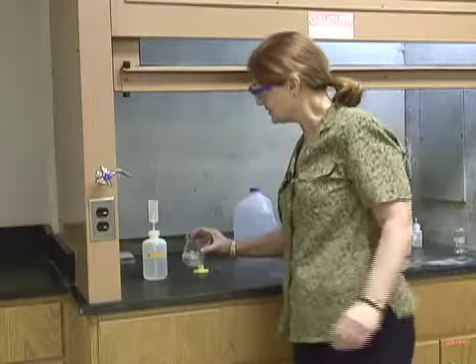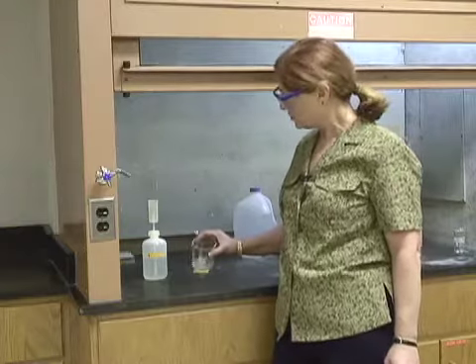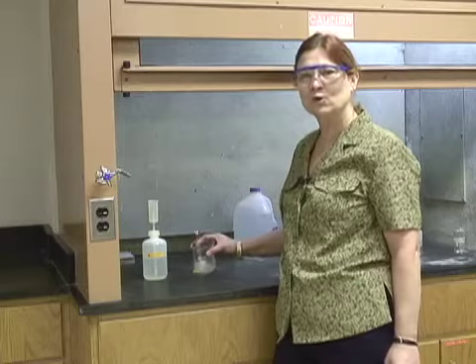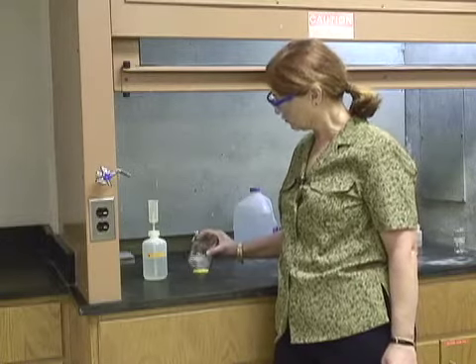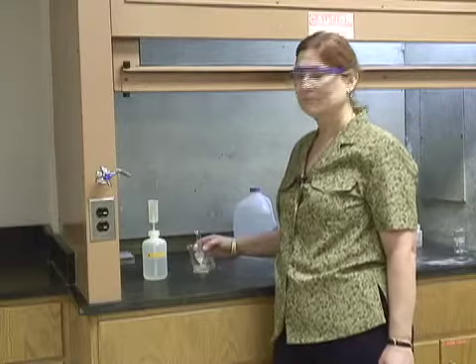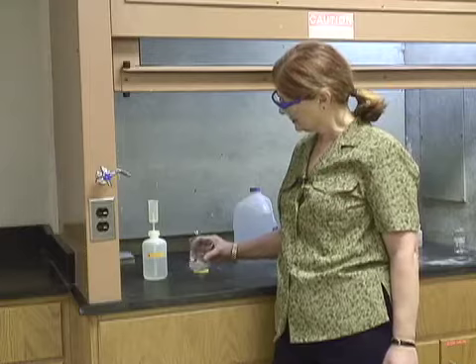And it's necessary for me to observe and to continue to swirl it. Swirl it, swirl it. I see the particles are getting smaller, and I need to be here and doing this.